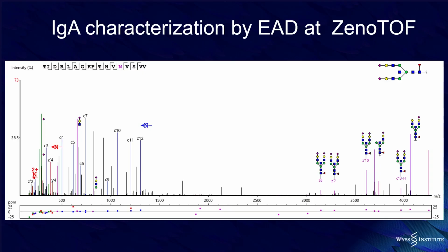I'm actually really still blown away by the amount of the intact glycosylation portions we have here. It's been deja vu for me. I was doing ECD about 25 years ago as a PhD student at the University of Southern Denmark, and it was a very different picture, I have to say.